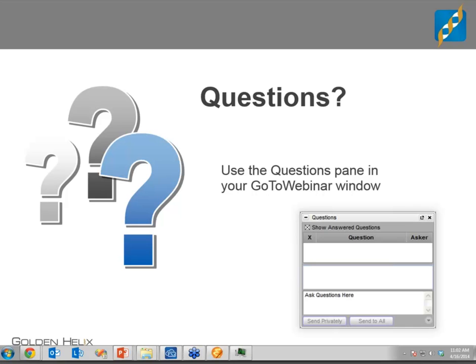Okay, let's go over to questions. I'm going to flag one here. So do they really start with k-mers is the question. Of course not. I was actually very simplifying the example with a k-mer. You would never actually index the entire genome with such small k-mers. I'm not quite sure what the default key size is. On a modern algorithm, I'm pretty sure it's close to 30, sometimes 15, but more like 30 for indexing. And obviously I was creating a simple example for us to walk through there.